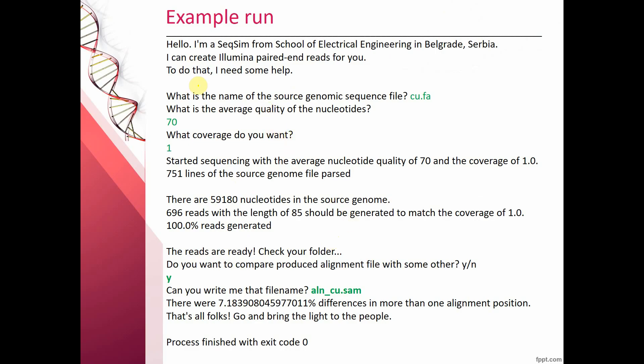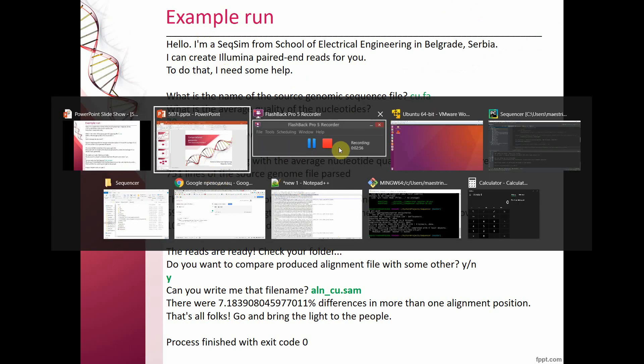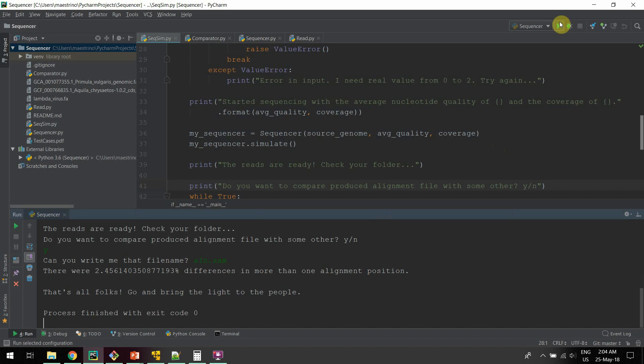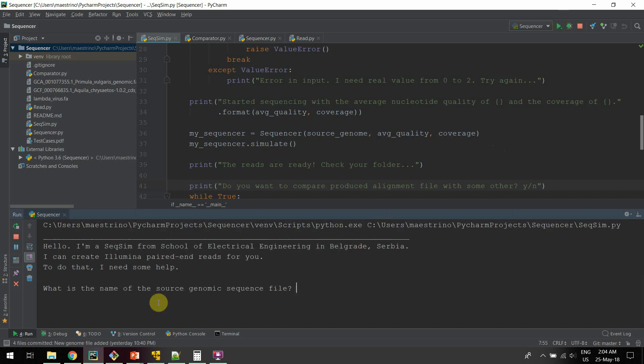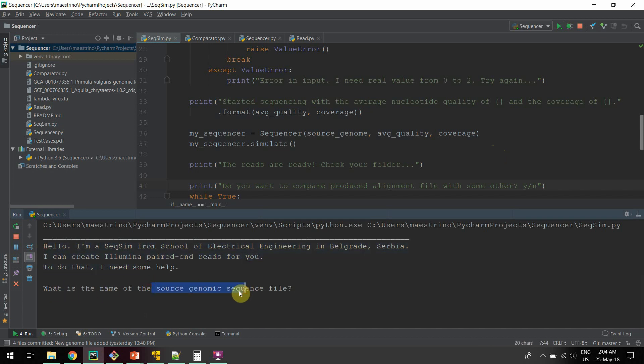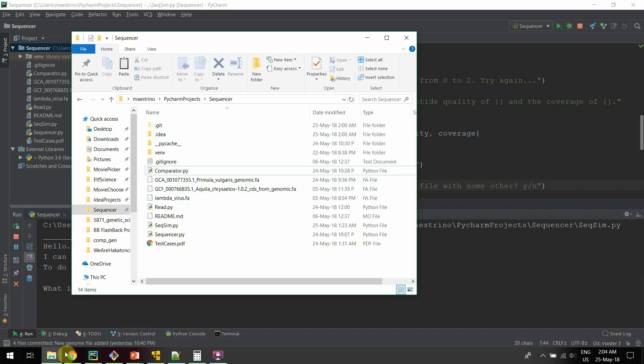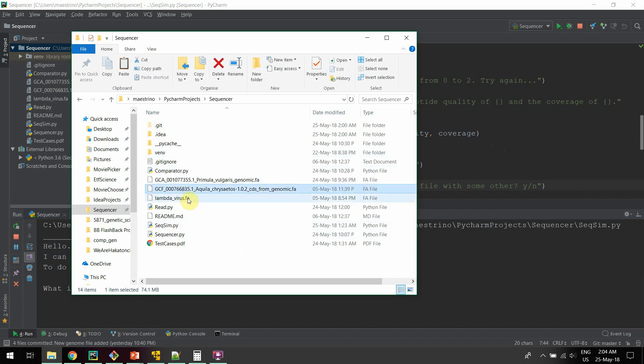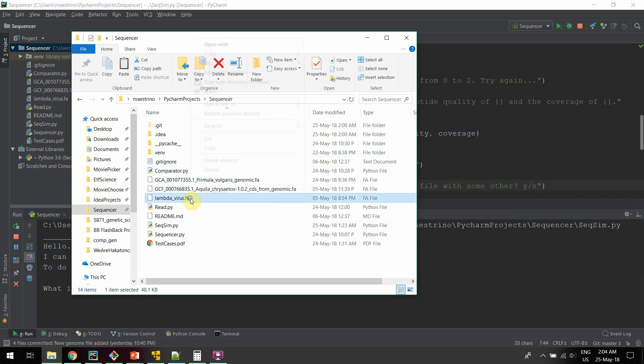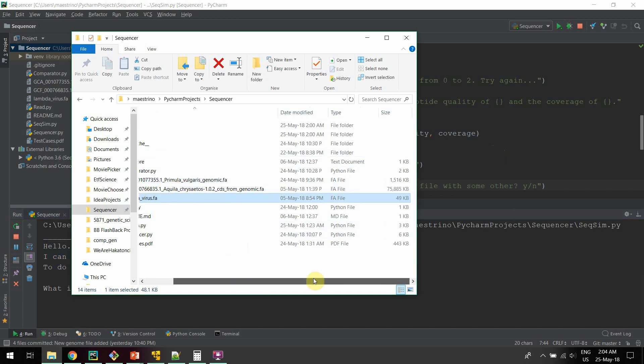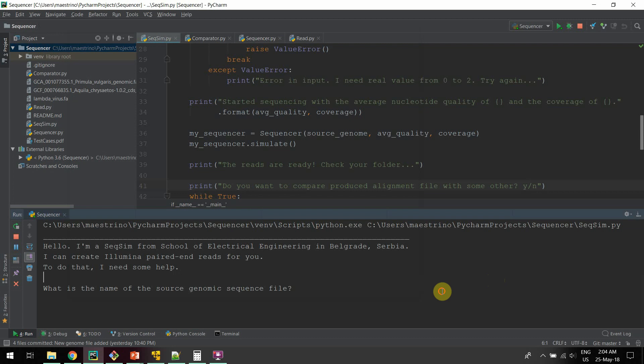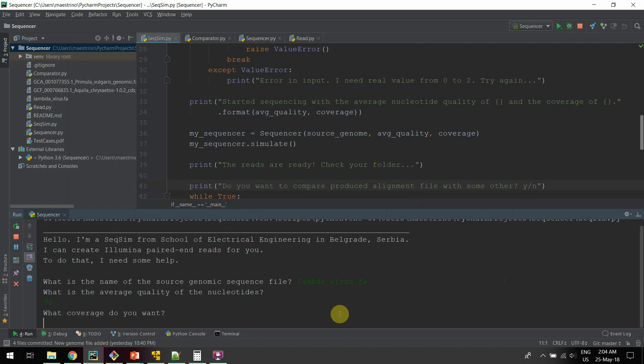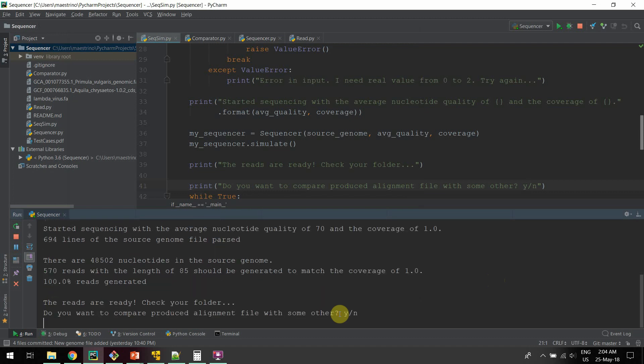In this presentation there is an example run, but I will do this right now. I will run this program, and now it welcomes me and it asks for the name of the source genomic sequence. There are three in the repository, we will take the shortest because the processing is the fastest. The name of the source sequence is this. The average quality, let's say 70, and coverage of exactly one.